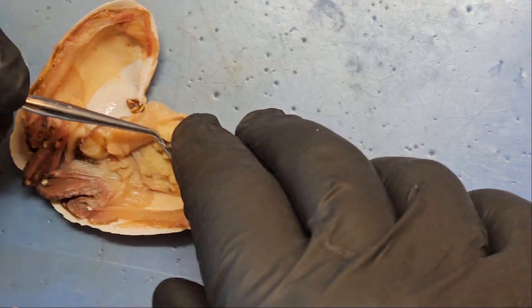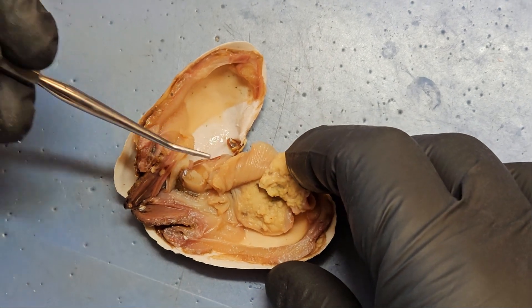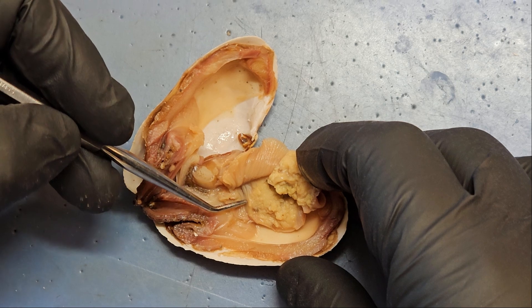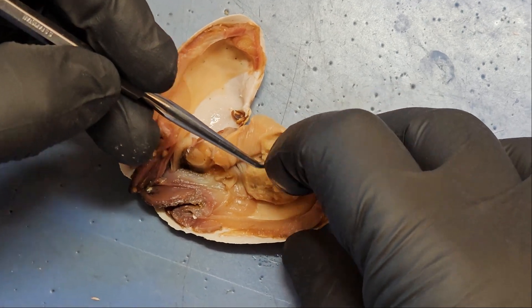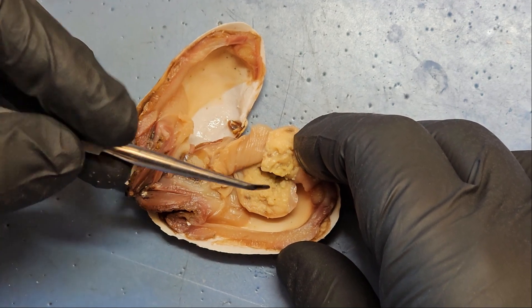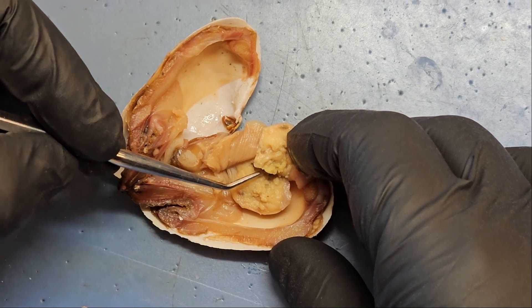Now we're going to open up our clam. Here we have our visceral mass that has been mid-sagittally cut. We can see the posterior foot retractor muscle here, and the anterior foot retractor muscle right here.